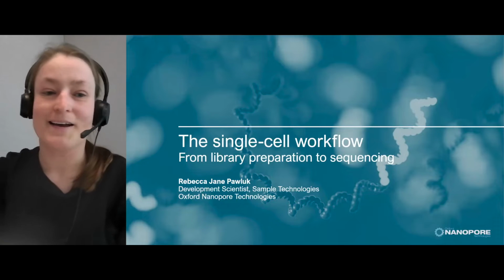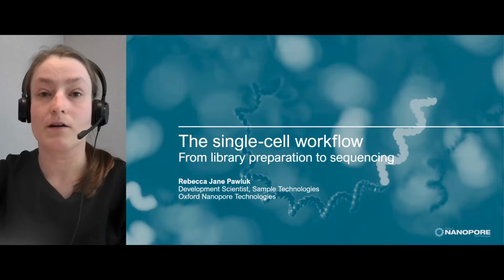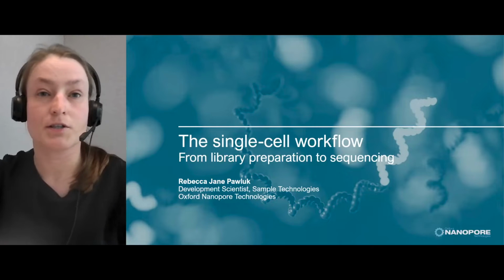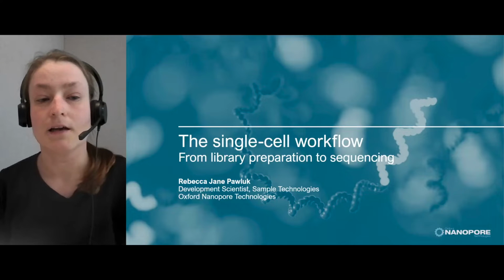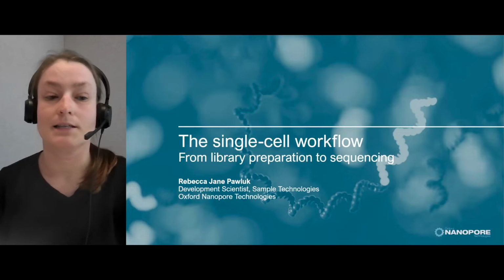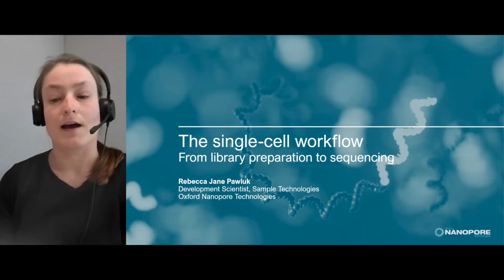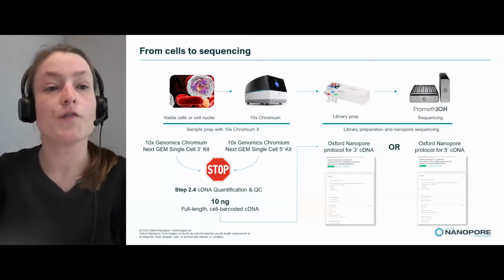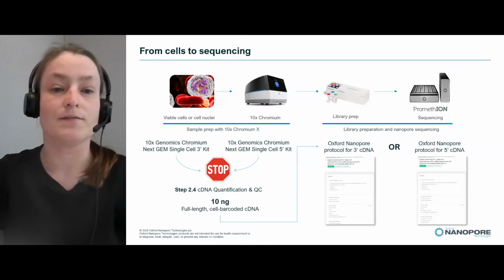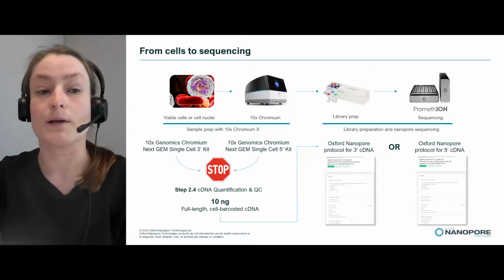Yeah, hi. So I will talk to you about the single cell workflow. I'm mainly going to focus on library preparation right through to sequencing with our PromethION devices. My name's Rebecca. I'm a development scientist here at ONT, and I will be able to answer any questions you have on our protocols. So this is just an overview of what you might expect if you were running the 10x all the way through to sequencing with ONT.